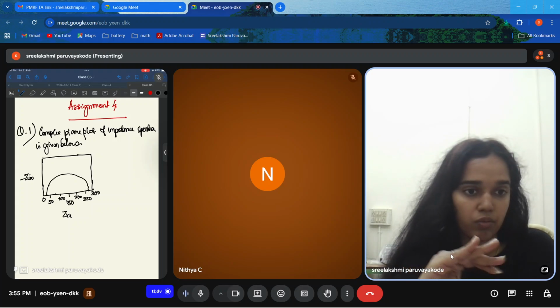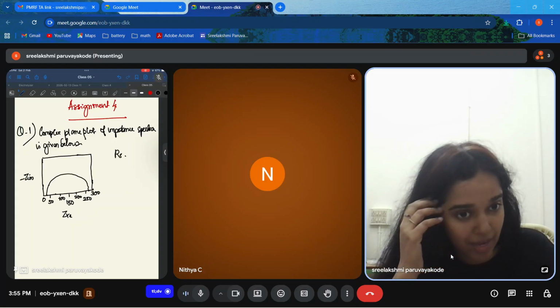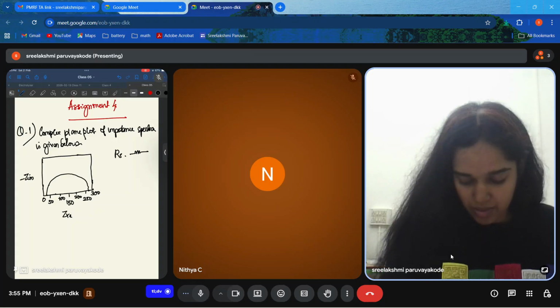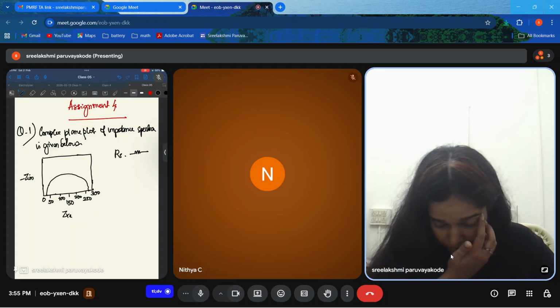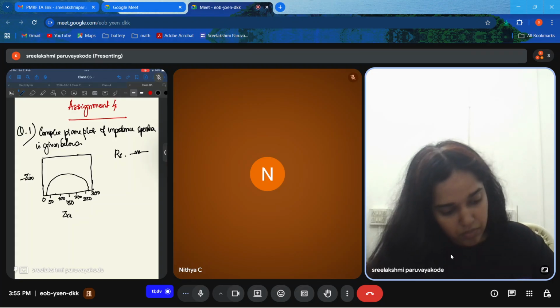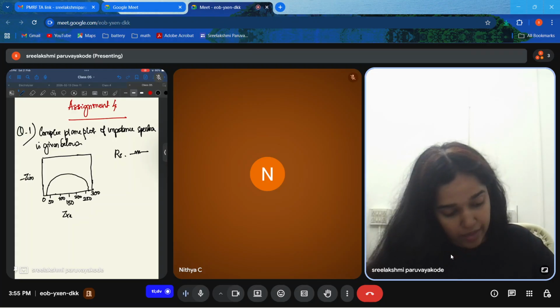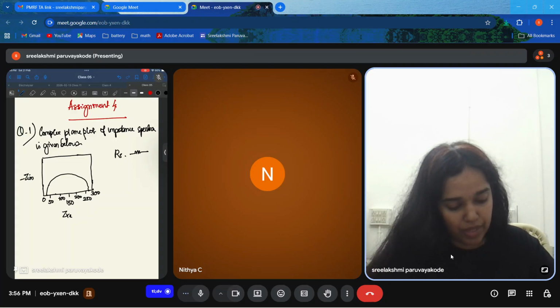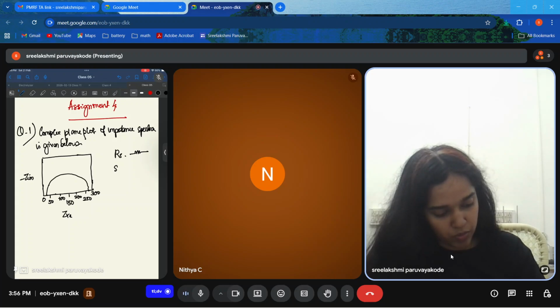Origin, it's not starting. So it means there is the initial RS value. Solution resistance exists. So that is modeled using a resistor. Now you have a single loop.